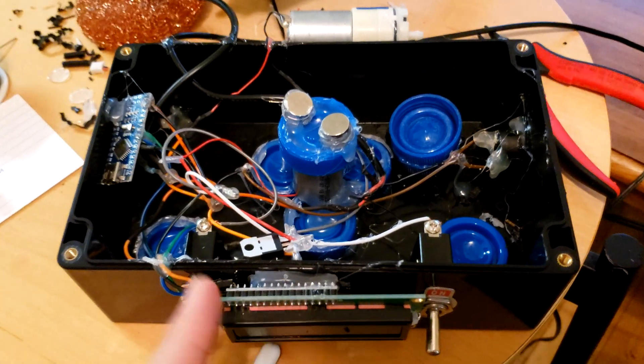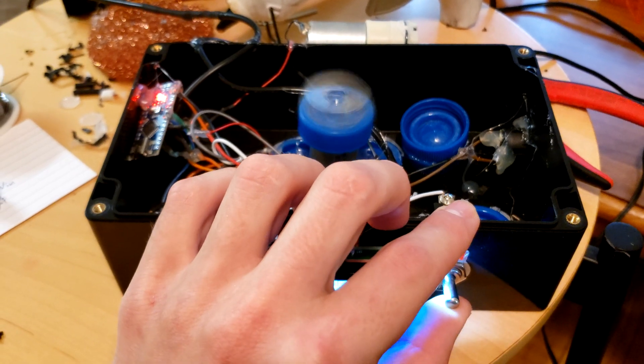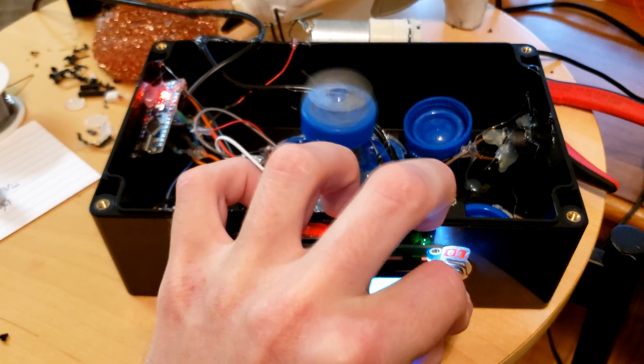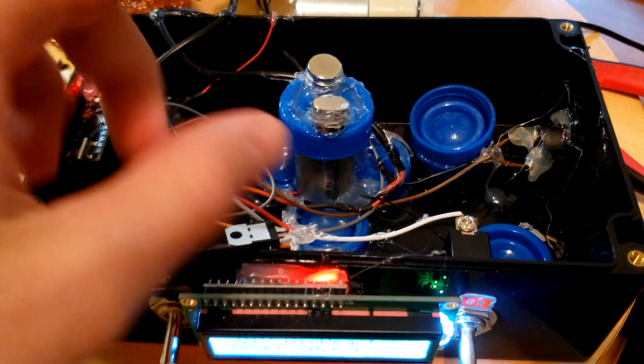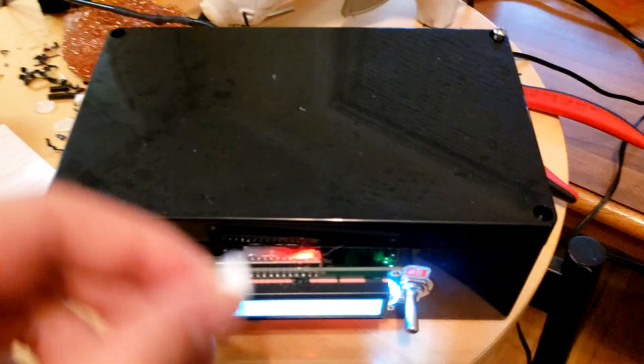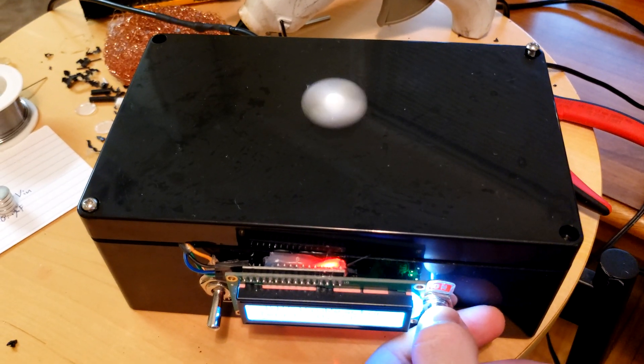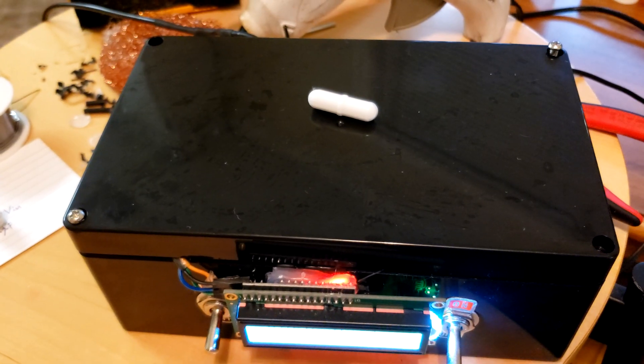Okay, so it's a few days later now and I think everything is done. Here is the motor. Please don't kill me. Okay, so it moves at a pretty good speed. And when I actually put the lid on and I use my stir bar, that looks like the perfect speed.